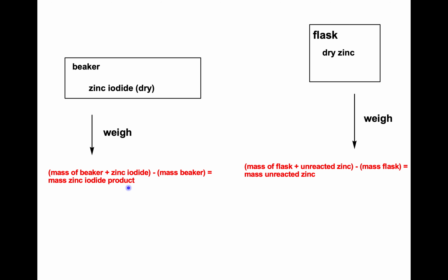If you had already gotten rid of all the methanol, when you add it back, you'll see the same mass before heating and after heating, and that's what you want to see. So I would suggest heating it up for a while and then waiting for it to cool, putting it on the balance, recording the mass. Then returning to the hot plate, heating it up again for another 5 minutes or so, and then returning to the balance. And if the mass has not changed, that means that you've completely gotten rid of all of the methanol and you're ready to continue.